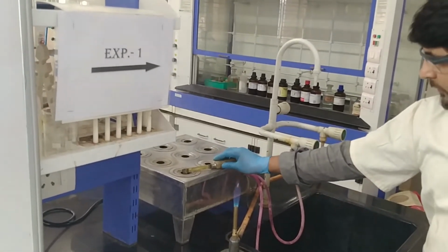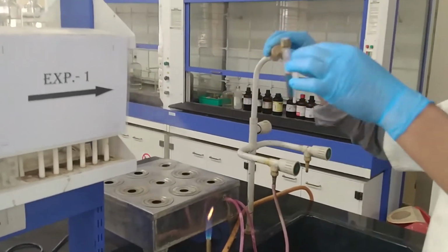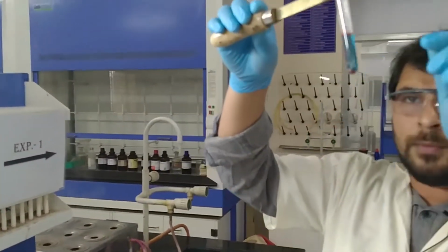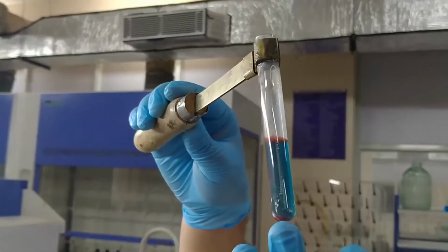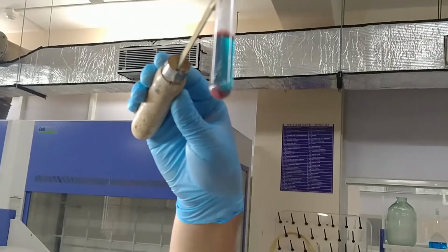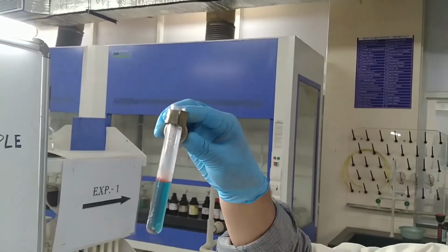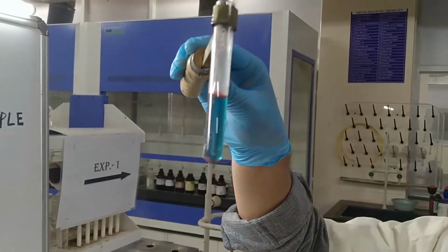Now just check this one. Yeah, something appears over here. Actually in this case also a red precipitate should come. This one is not like the previous test, but at the bottom you can find some reddish thing is already deposited. Okay, and the color of the solution is also changed. It's not like the color when I added the Barfoed reagent initially. So that means this is also positive.